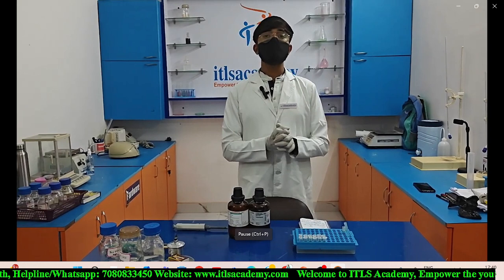So as you can see, I am pouring sodium acetate in each of the eppendorfs. So after adding 100 microliter of sodium acetate in each of the eppendorfs, now I am going to add 200 microliter of ethanol in each of the eppendorfs.